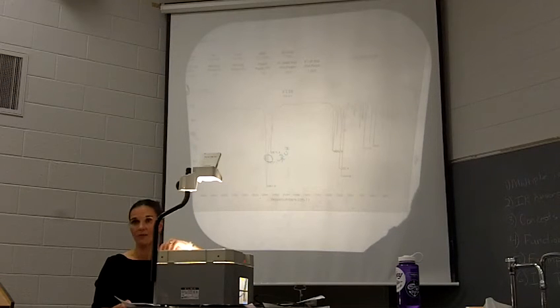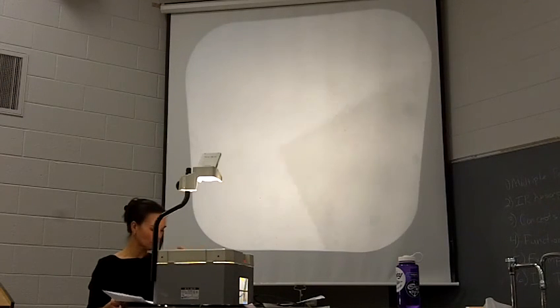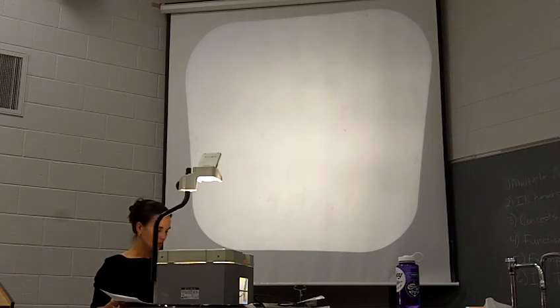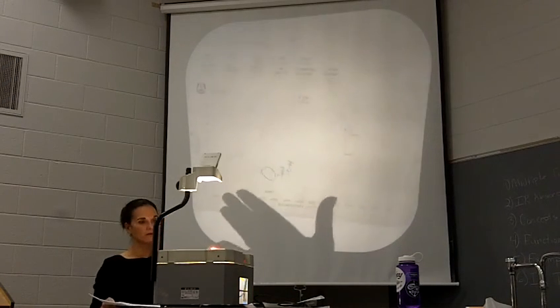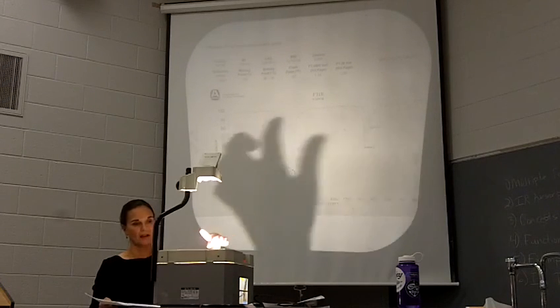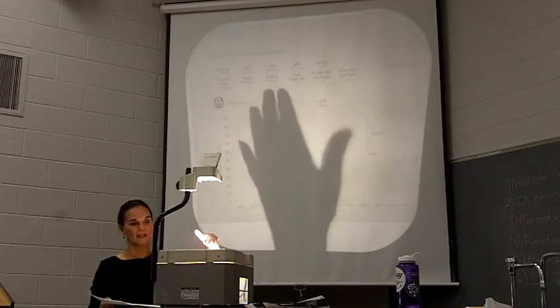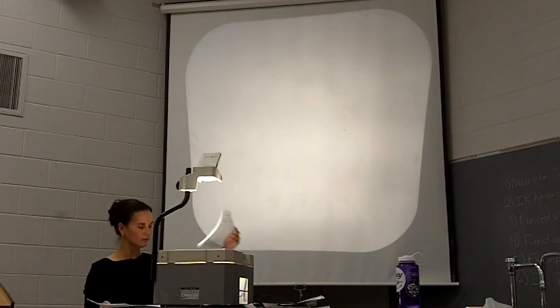was positive, okay? Now, if you think you have an alkane, make sure that you definitely have a negative Beilstein flame test, because that's the only way to tell the difference between those two functional groups, all right? And so here's an example of an alkane. Again, it's just sp3 CH, so there's not really any difference between this and it being chloropentane, okay?